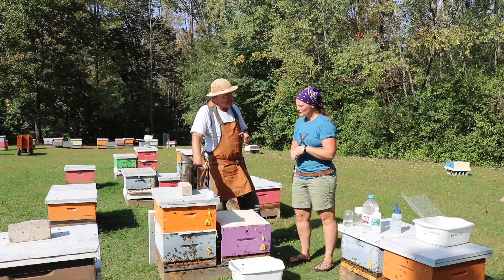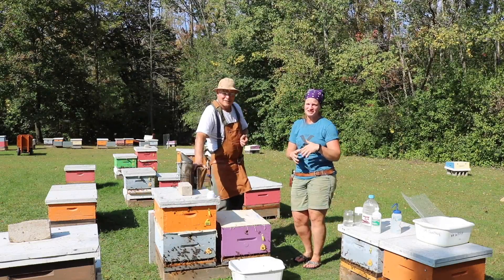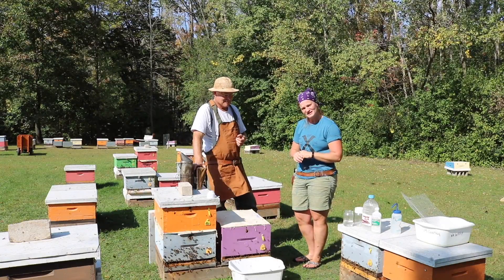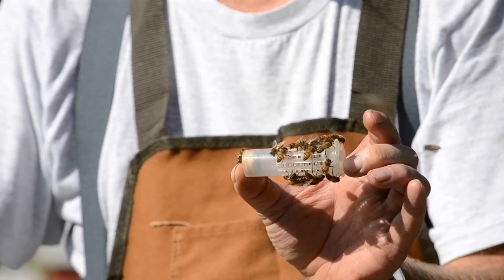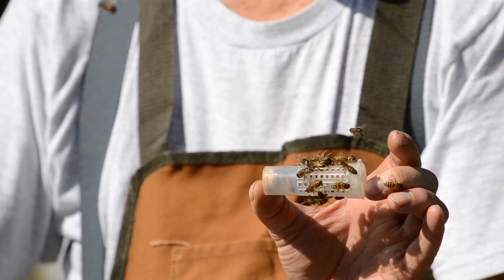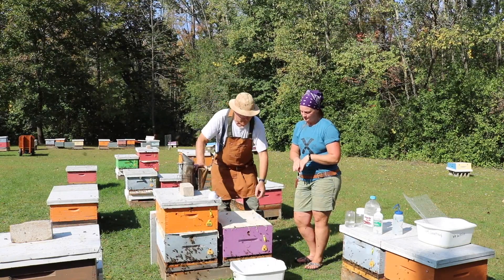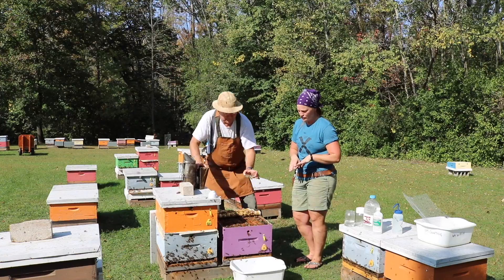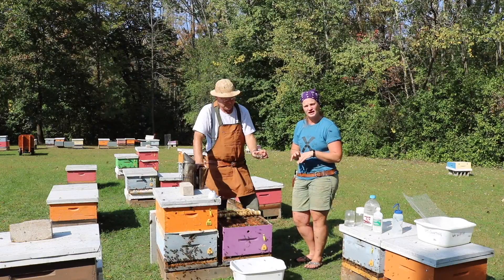What do you do about the queen? You don't want to get the queen in your alcohol wash. This unfortunately does kill some bees and we don't want to kill the queen — she's very important for the success of the hive. It is recommended you go in ahead of time, find your queen and cage her, or put her on a frame and take her into another box temporarily so that you're not shaking her into the tub. We have found our queen today. She's caged in a roller cage and we want to make sure that she's safe for this process, so she's going to stay in that cage until we're done.